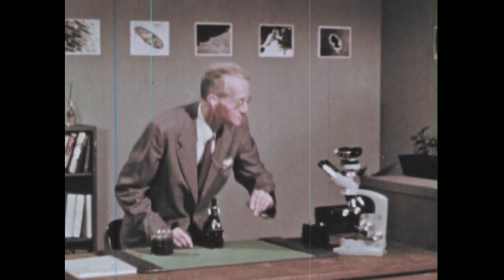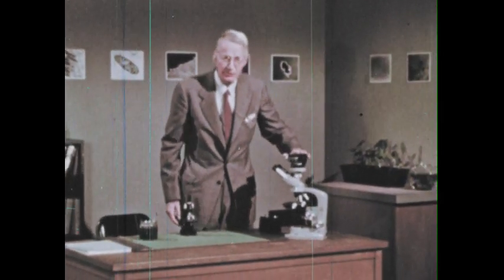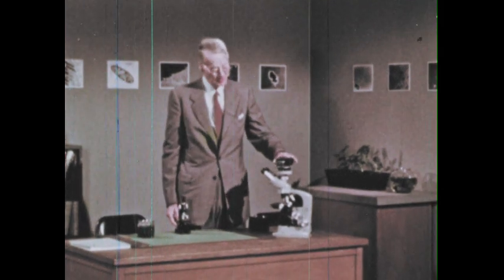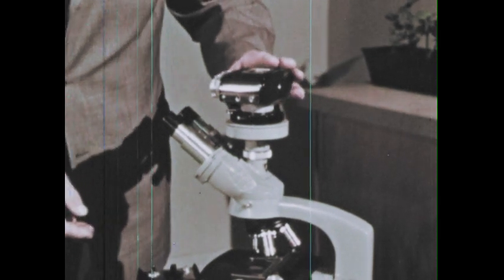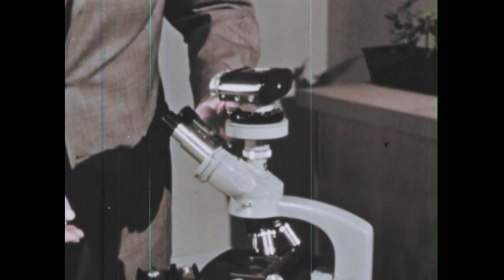The material is so interesting. I've been looking at paramecium and euglena and amoeba. I think it would be nice to look at them through a better microscope. Now this is much better, not just because it's bigger, but because it's made with the utmost skill and precision.